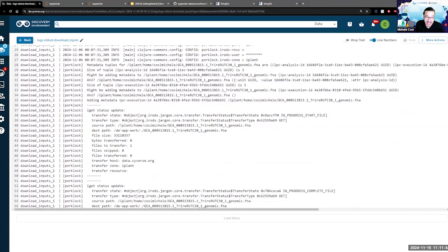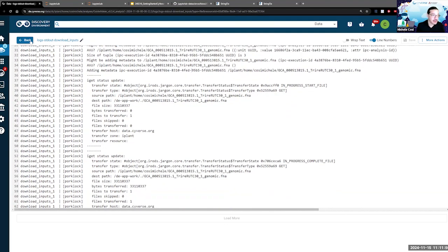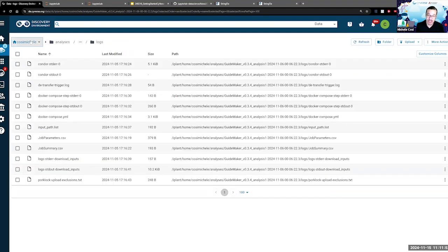And it is not unlikely that perhaps the transfer fails, and therefore sometimes you might just need to restart it. Sometimes you might need to specify the name of the path and the name of the specific file better. Maybe you made a mistake there. So there are different things that may change.